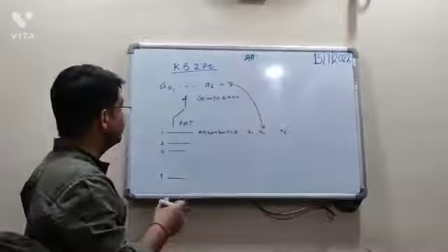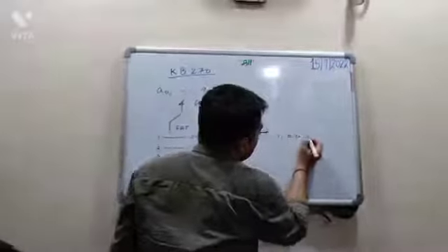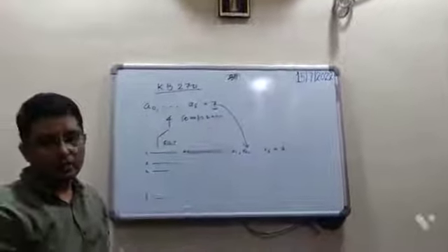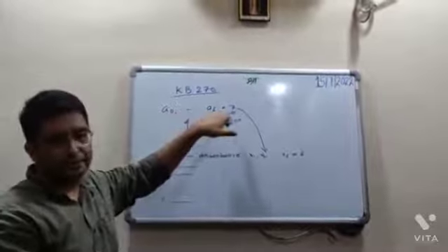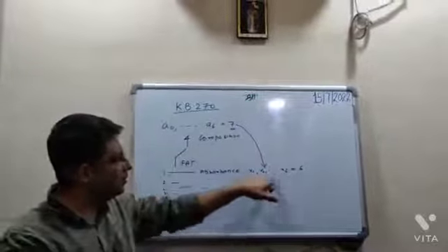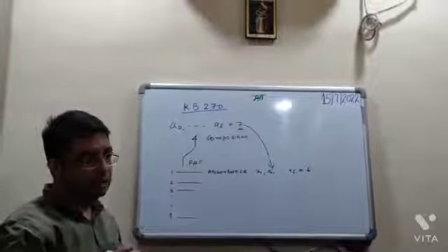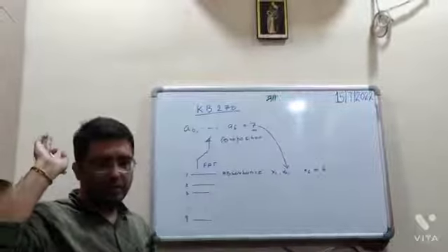Then what is the relation? These are 6 coefficients and these are 7 coefficients, so you cannot establish a relation because both have different values. Now the question is, what is this A0 to A6? For each sample you will have these absorbance values, so ultimately it will be represented in terms of a waveform. I have not seen the software, but it may be in the form of a waveform. Am I right or wrong?